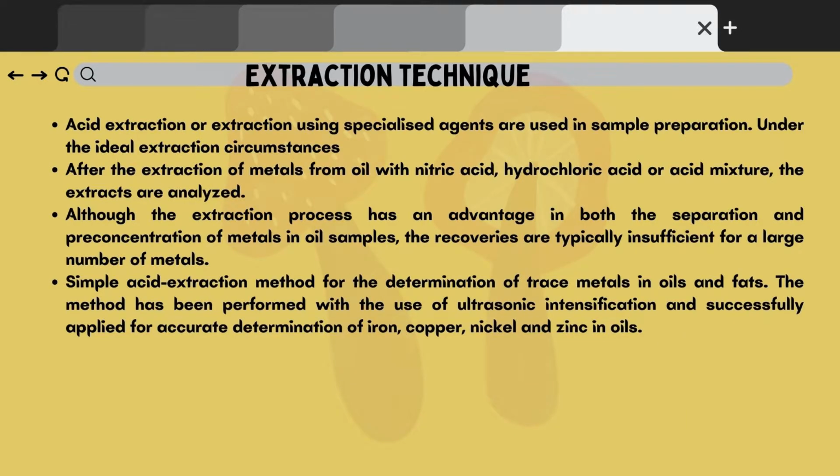Next is extraction technique. Acid extraction or extraction using specialized agents is used in the sample preparation. Under ideal extraction circumstances, after the extraction of metal from oil with nitric acid, hydrochloric acid or an acid mixture, the extracts are analyzed.